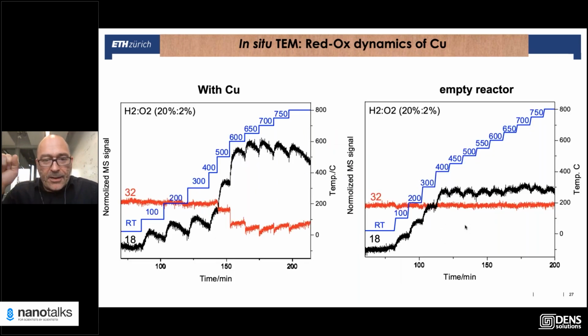Anyhow, we wanted to check if all these dynamics are related to catalytic water formation. So we have a mass spectrometer connected to our setup. And here's what we get when we have this tiny amount of catalyst between these MEMS chips in the microscope. And we study the dynamics. And at the same time, we see when we ramp up the temperature, when do the dynamics set in, and is there any water forming?